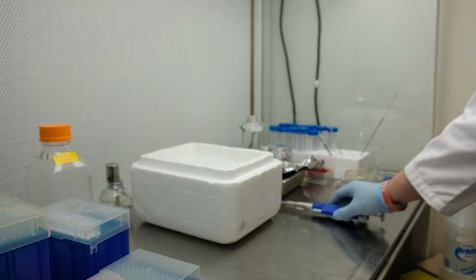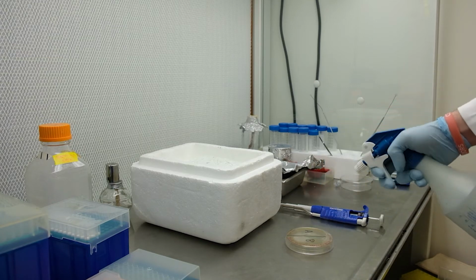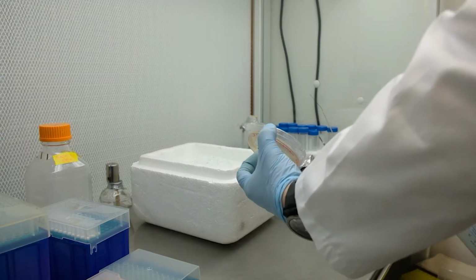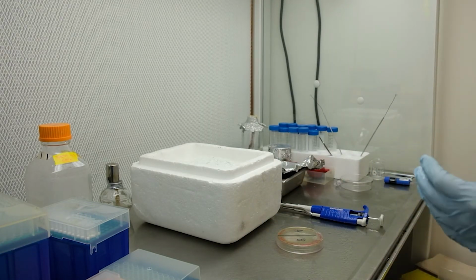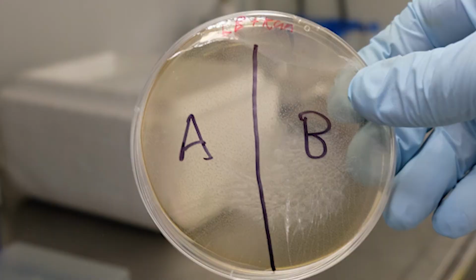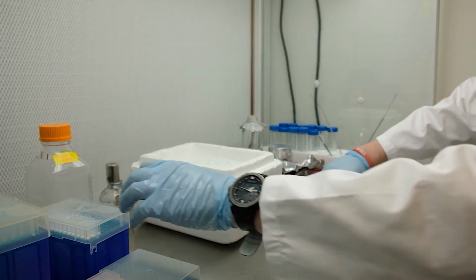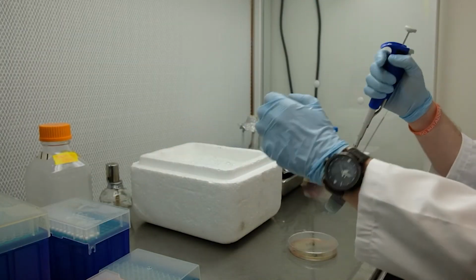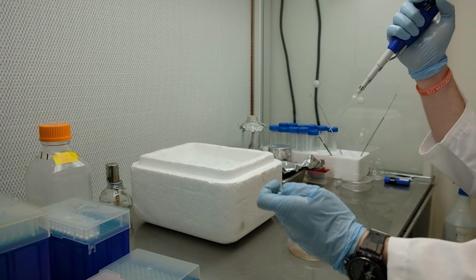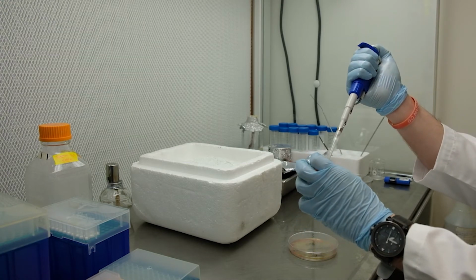The last step is to inoculate solid media in a petri dish with your cultures. I split my plate into 2 zones so that I can use one plate for both of my cultures. For this part, you simply aspirate all of your SOC culture and dispense it on the right part of the petri dish.